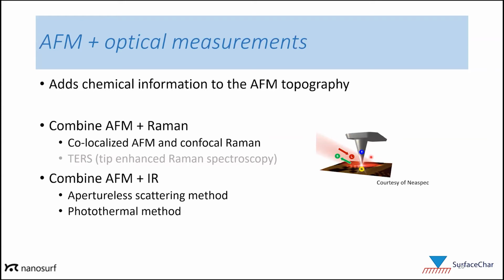Now, there is another technique called TERS, or tip-enhanced Raman spectroscopy, where you actually use the AFM tip as an antenna to focus the light right underneath the tip. This gives you much higher resolution. But TERS is actually very challenging to operate, and there are really only a handful of niche applications that it's useful for.